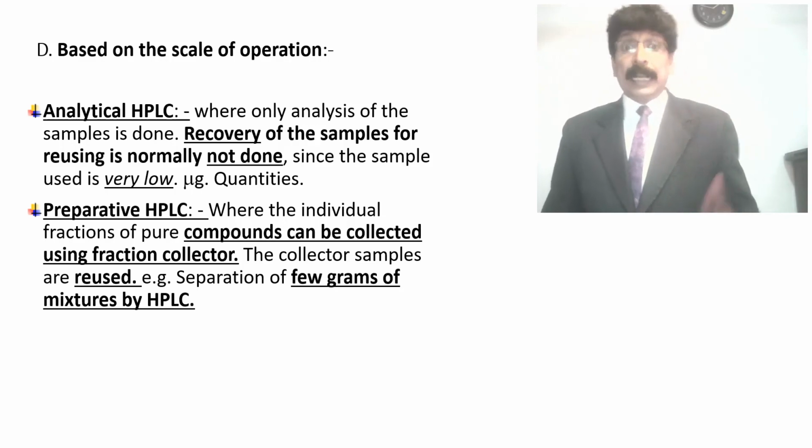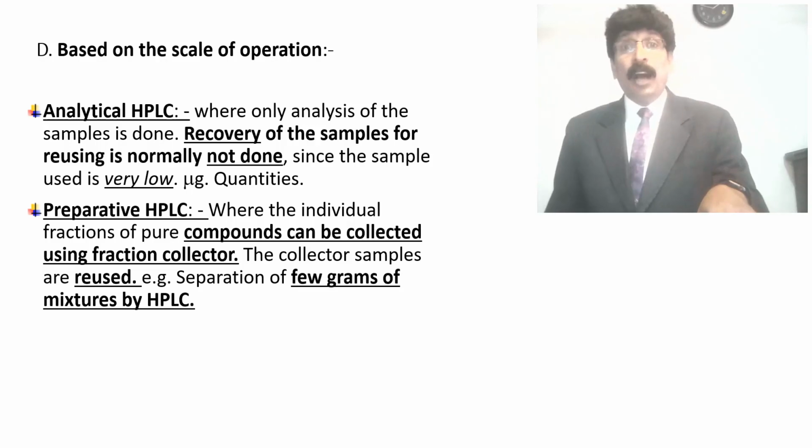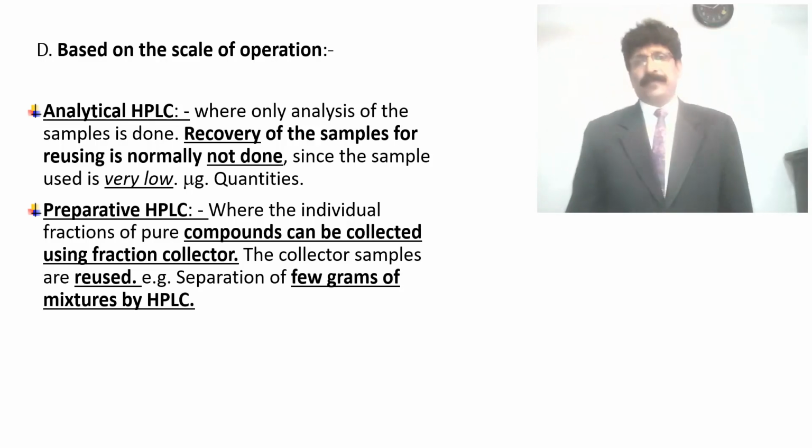The collected samples are reused. Separation of a few grams of mixtures by HPLC. So the quantity is microgram in analytical HPLC, and grams in preparative HPLC.